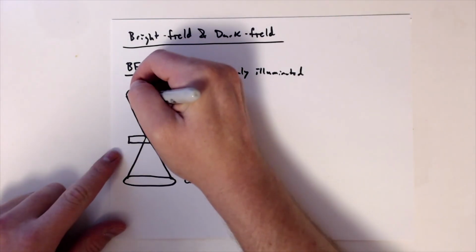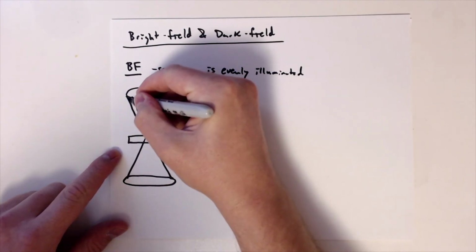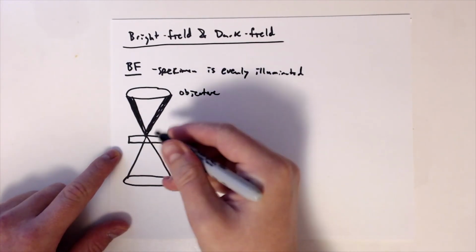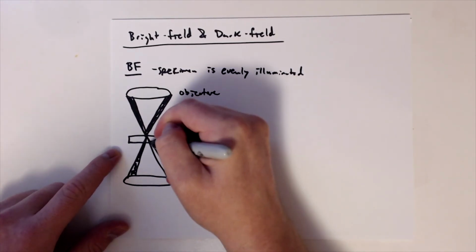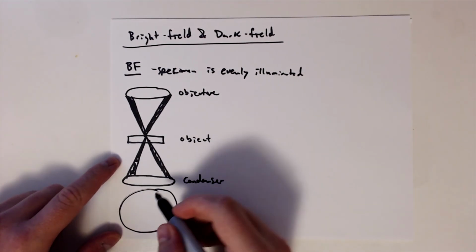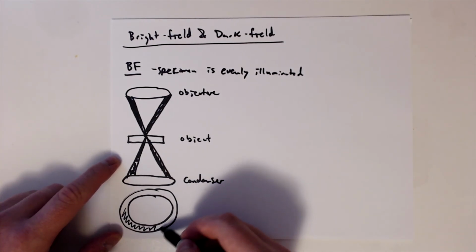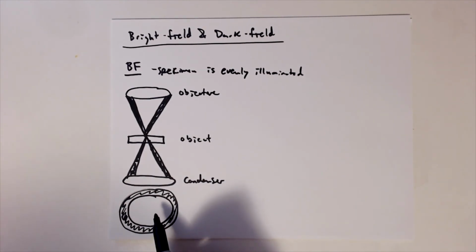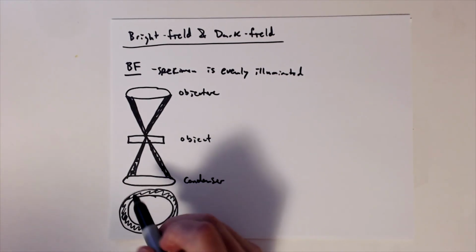So typically how we draw this is we draw another set of the external light that may be blocked. So light around the edges is blocked. So if we see the light from top down, it would look something like this. So basically, light sort of at the very edge could be eliminated from the aperture.